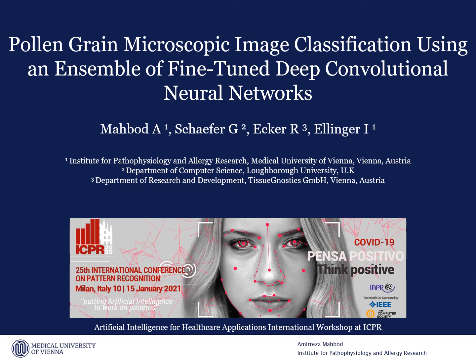It's my great pleasure to present our work in the Artificial Intelligence for Healthcare Application International Workshop at ICPR. This work was a collaborative project between Medical University of Vienna, Loughborough University and Tissue Gnostics. The title of our study is Pollen Grain Microscopic Image Classification Using an Ensemble of Fine-Tuned Deep Convolutional Neural Networks.